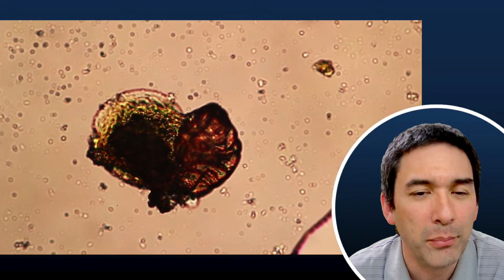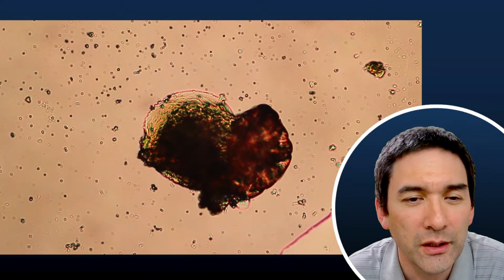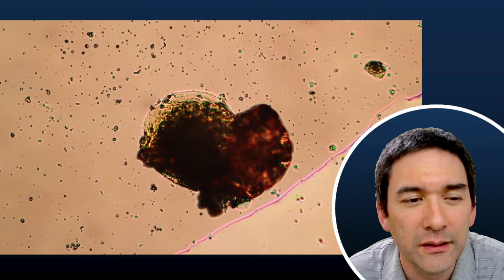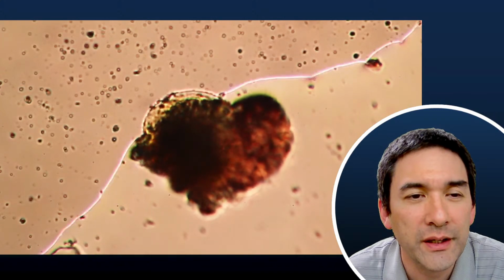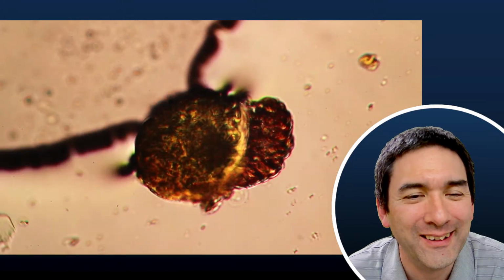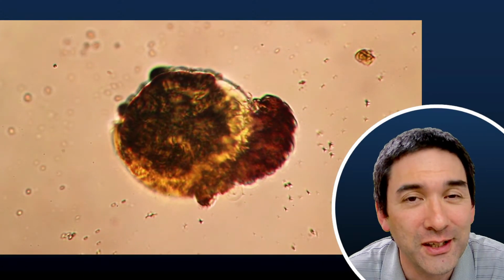See, from the bottom right side, hidden behind my face a little bit, there is now some water approaching. And now it's contacting the tardigrade and whatever it was on. And look, it starts to swell up again. It soaks up the water again. It starts to become large again. But the question is, of course, did it survive that ordeal?